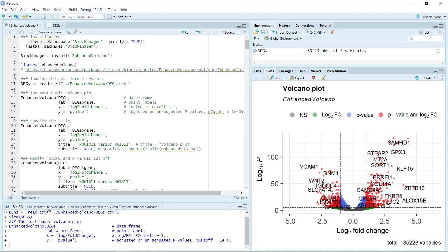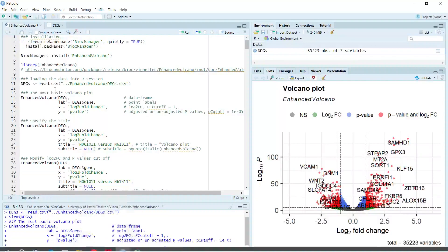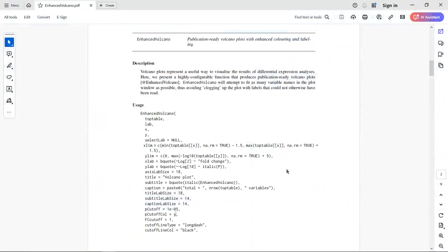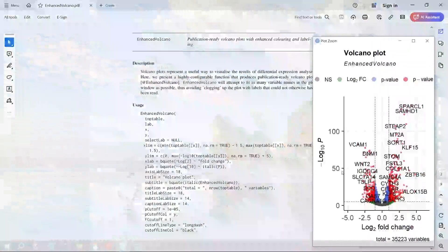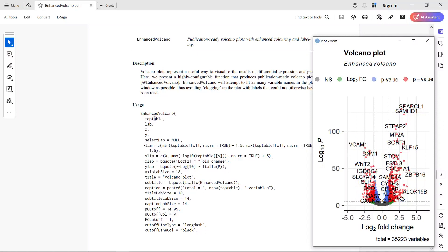You can see it is very easy to generate the basic volcano plot — you just need the gene column, the log2 fold changes column, and the p-value column in your dataset. Now let's look at all the arguments in the enhanced volcano plot package. You can use x and y to specify your data columns, and x.lab and y.lab to adjust the x and y axis labels. The default x and y labels are log2 fold changes and -log10 p-values.